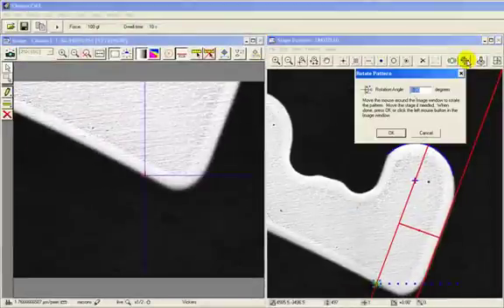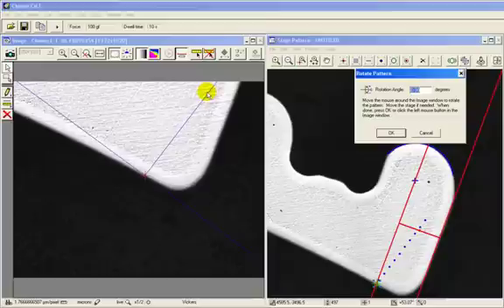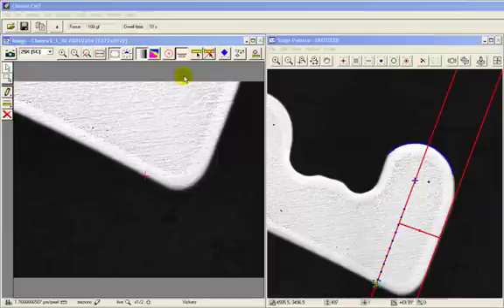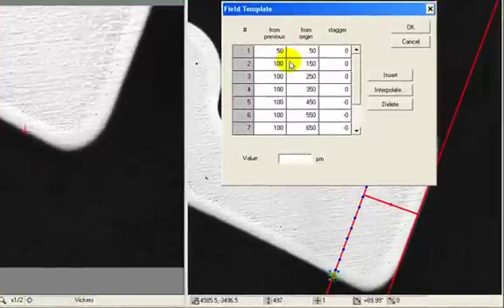After this is done, you can rotate the pattern into the correct orientation. It is still possible to modify the indent spacing to custom values prior to running the test.